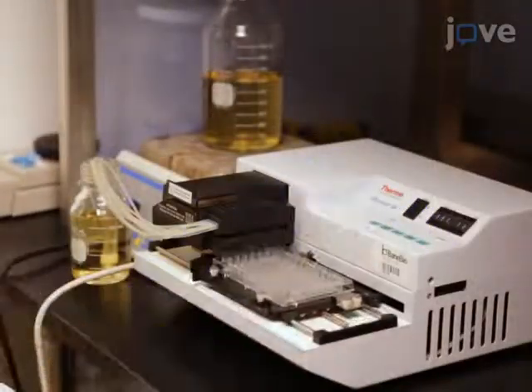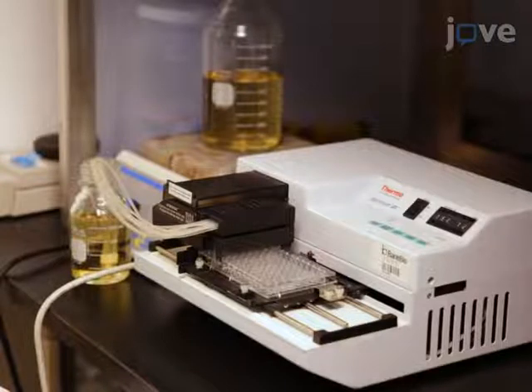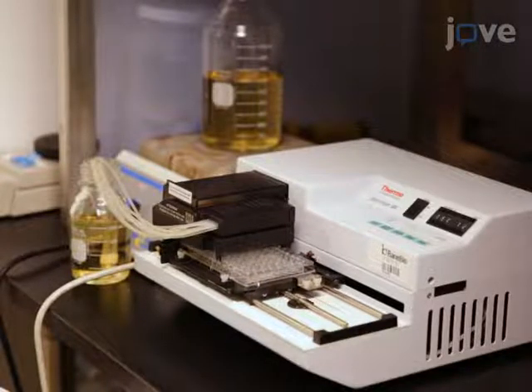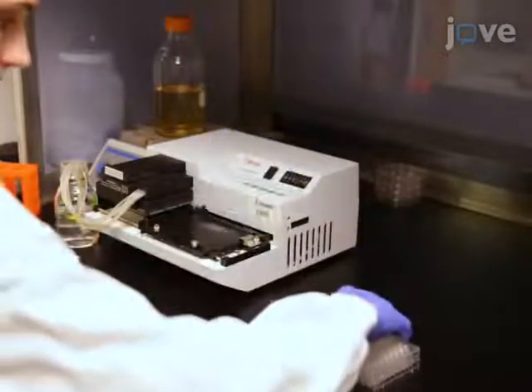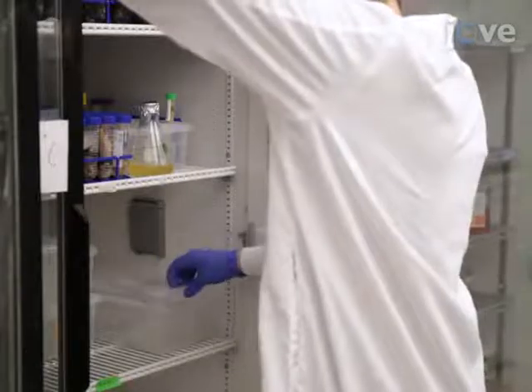To prepare high-throughput assay culture plates for screening, use an automated 8-channel dispenser to add 0.15 milliliters of molten nematode growth medium agar into each well of a 96-well plate. Allow the agar to solidify overnight, then store the high-throughput assay plates at 4 degrees Celsius for up to 2 weeks.